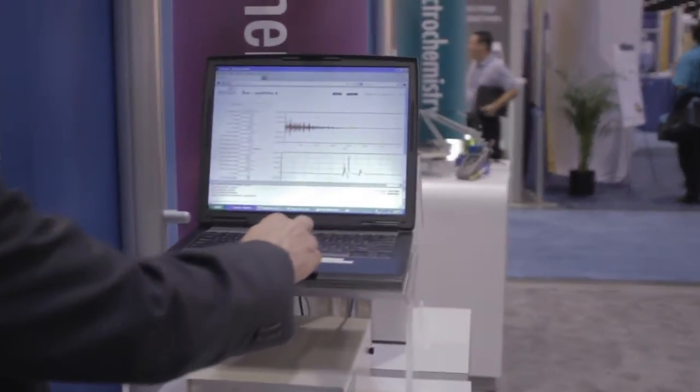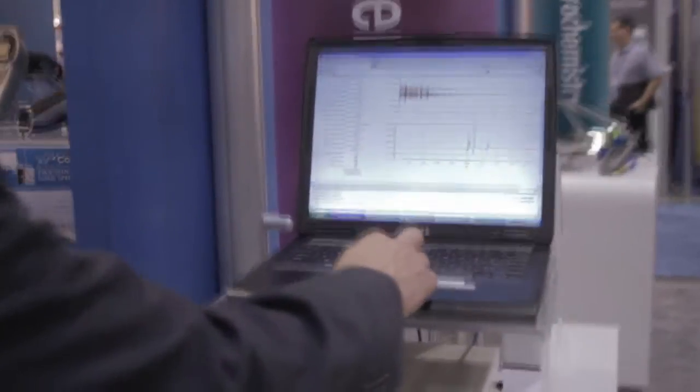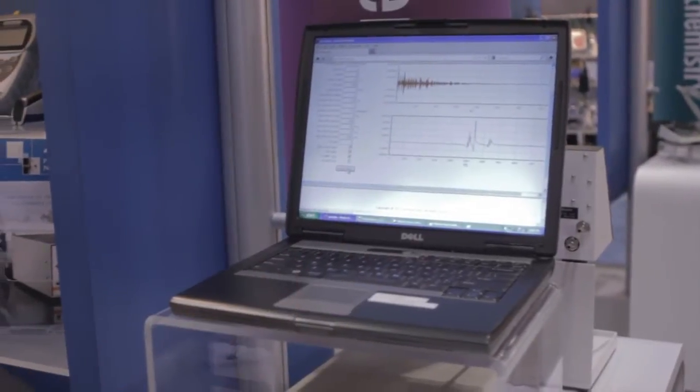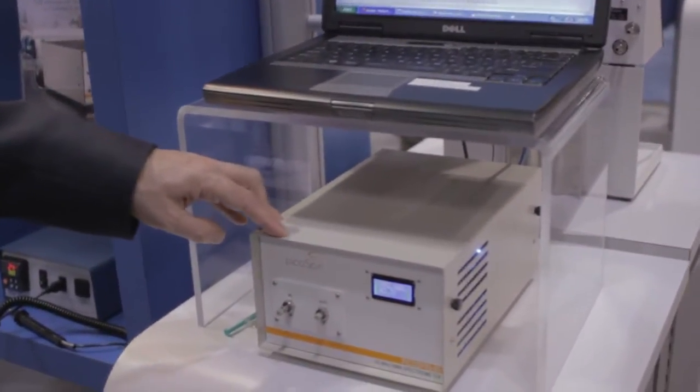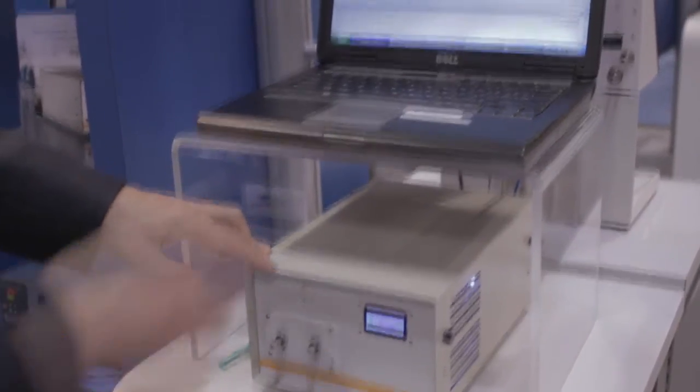So what we have right here is a web browser running a user interface for the machine. And right now this spectrometer is filled up with ethyl acetate. So I'll run it and it'll do a single shot.